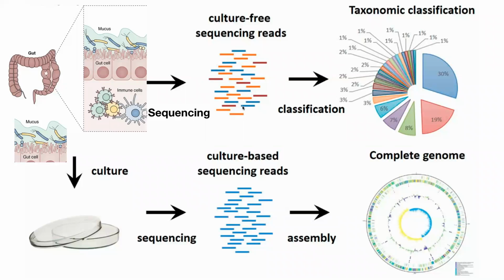So what we see here are some of the results that we can obtain, right? These are the two types of things that we might be interested in when we are looking at metagenomic studies. We can look at classification, the composition of different representatives inside this community, inside the sample that we have.